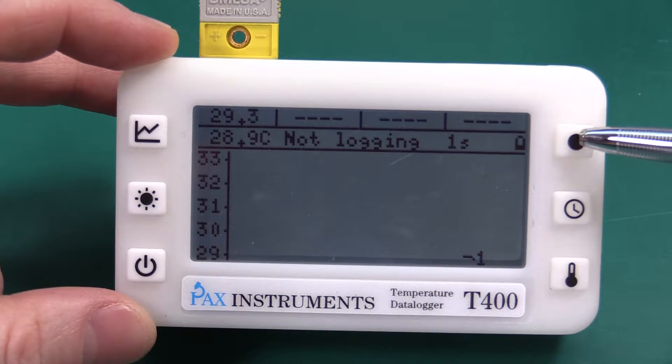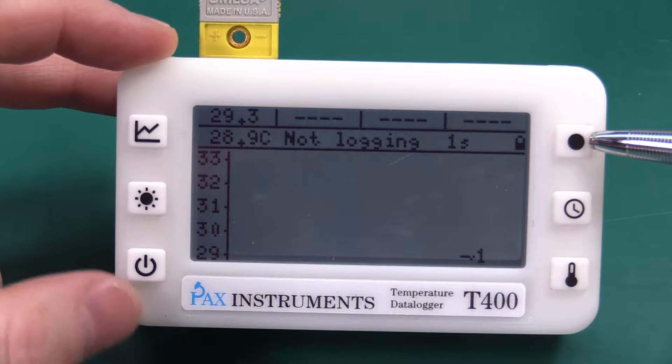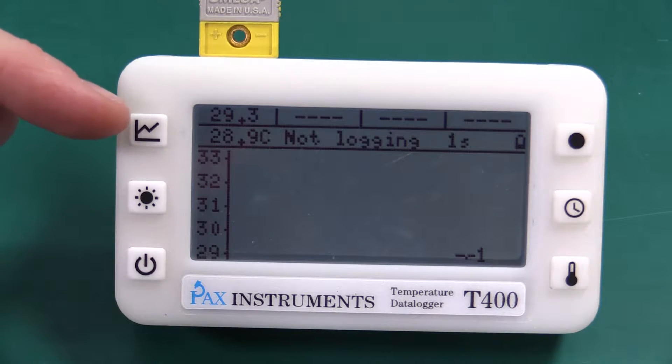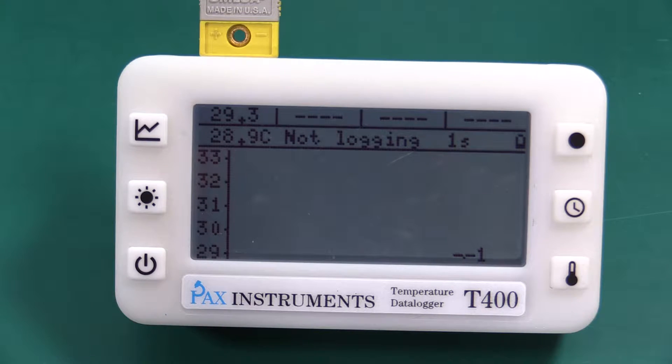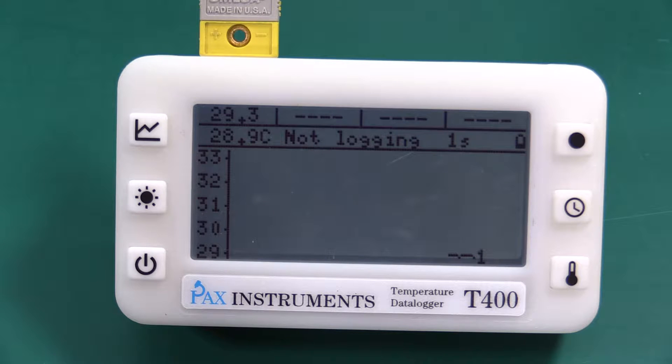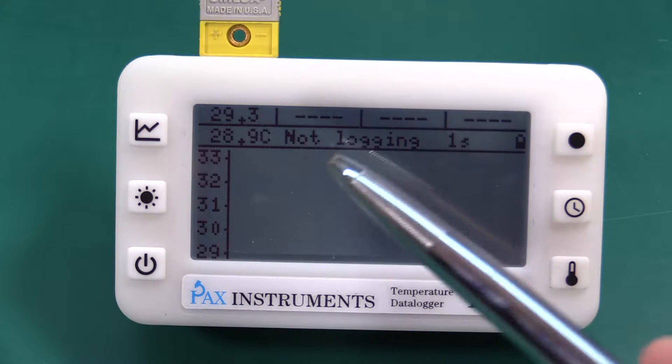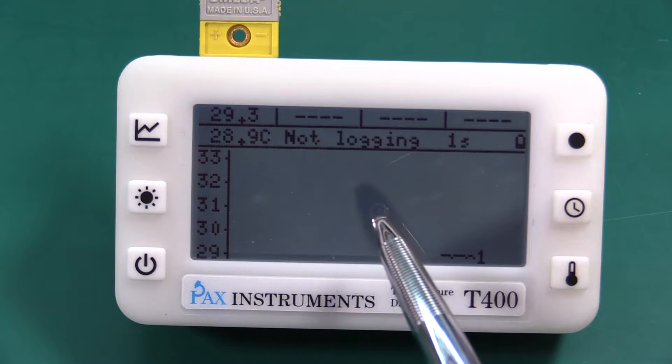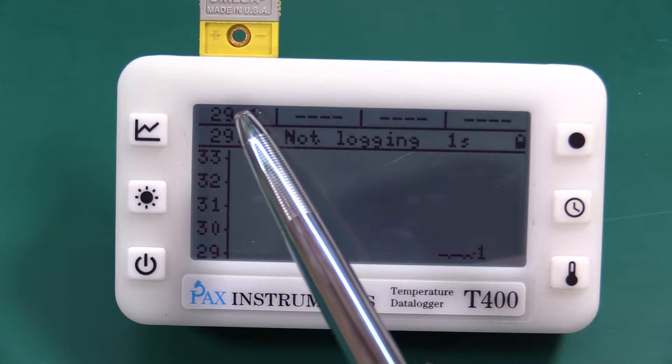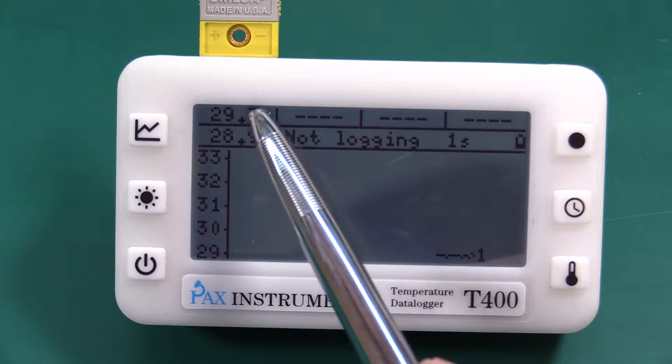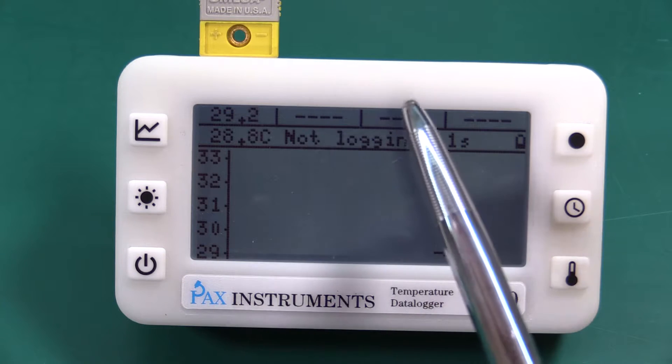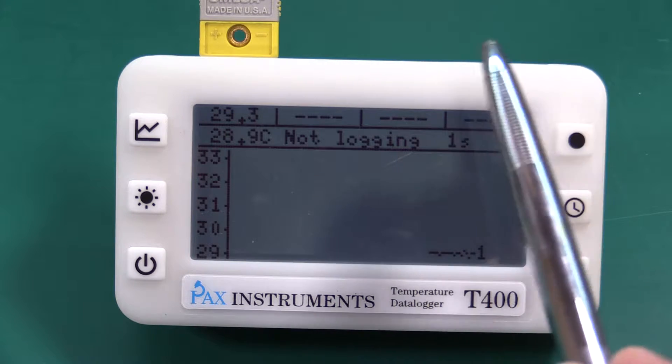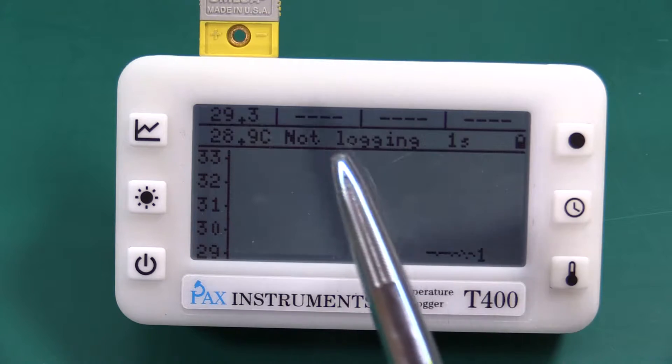We have our record button here and this button will once we implement the feature cycle through displaying all channels then just channel one, just channel two, just channel three, just channel four.